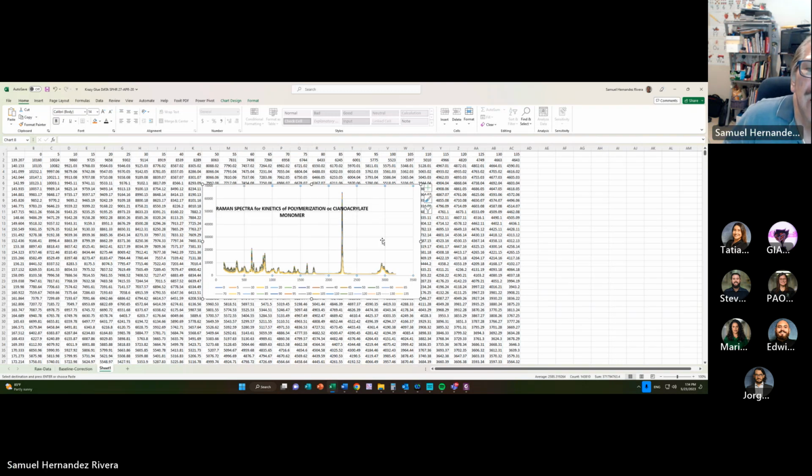Better? Yep, that's much better. Huh. Okay, I misspelled of. So let me fix that. Okay. So we put the title on one side so it doesn't interfere with any of the signals. Almost good. We'll work on that later on.